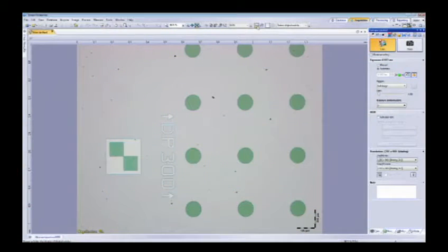One other new feature added on the screen for live quick measurements is a digital reticle. A lot of customers ask for this where they can be on a live image like we are. Now this scales as you change zoom factors and so forth, or lenses? Exactly. If you're integrated with the microscope, which our software does with a lot of our scopes, like this one here, it's a coded nose piece. As soon as you change objectives, it's going to modify and change the scale on the screen.